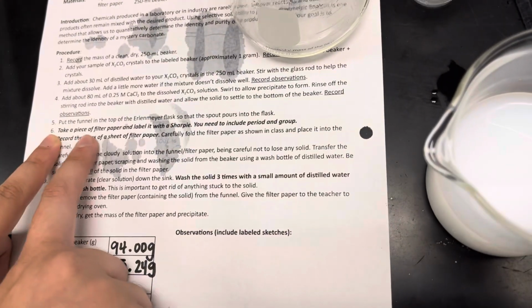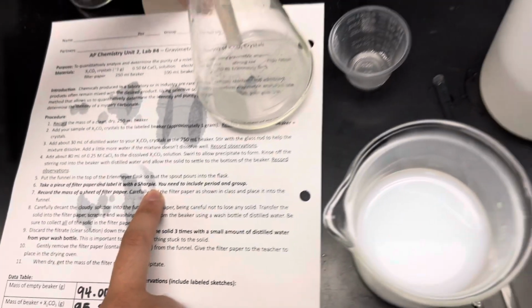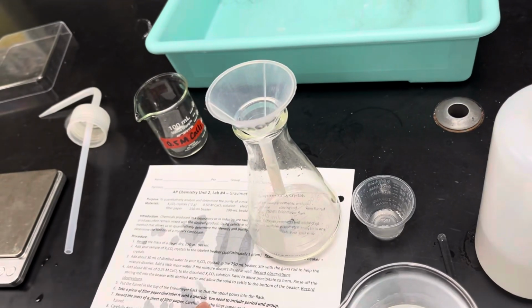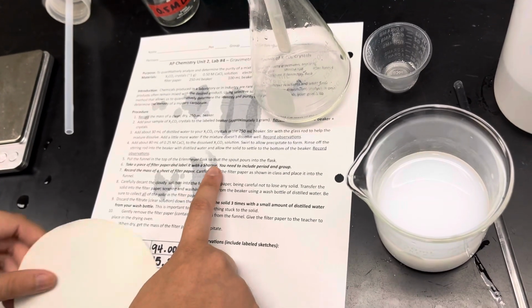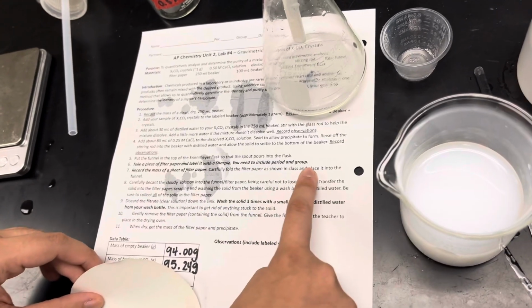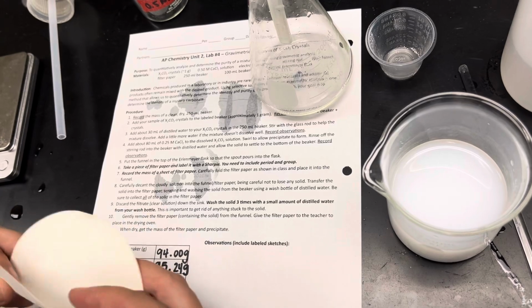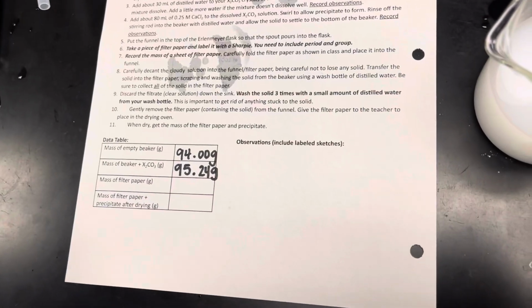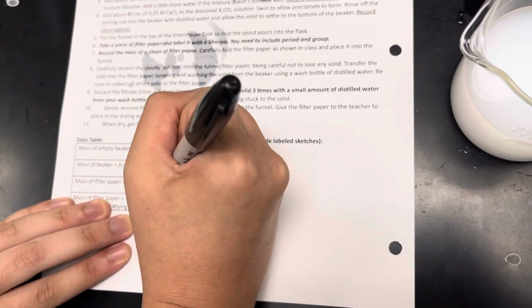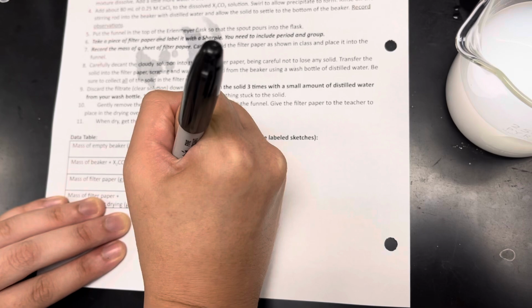Number 6, take a piece of filter paper and label it with a Sharpie. You would label this because I have so many students, so you need to know which one is yours. But this is just a demo, so I don't have to label mine. You need to include the period and group if it was you. And now we're going to take the mass of this filter paper. So I'm going to put it on the balance to get the mass, and then I'm going to write it on my table. So I'm going to get 0.81 grams. All right.